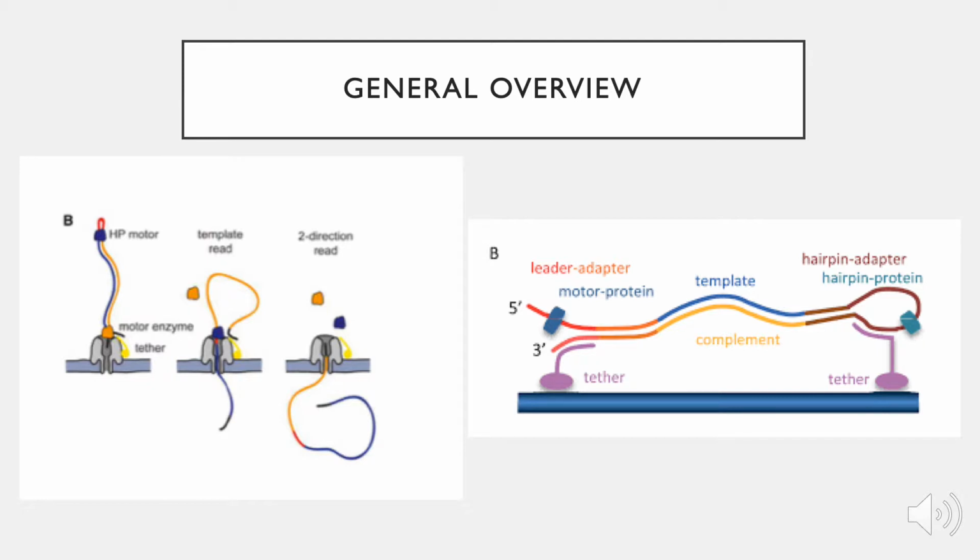The membrane contains tether proteins to which the DNA or RNA containing a tether attachment associate in order to draw the DNA or RNA to the nanopore. After tethering, the motor protein attaches briefly with the nanopore while the DNA or RNA is being passed.